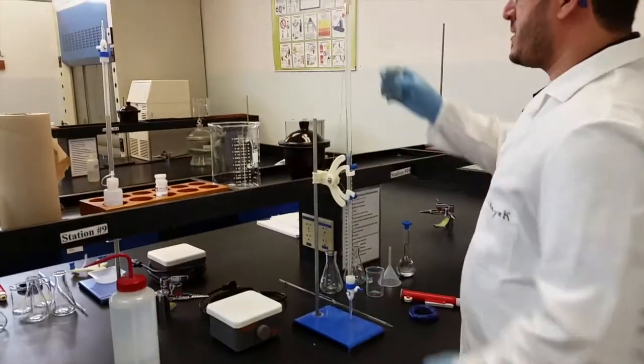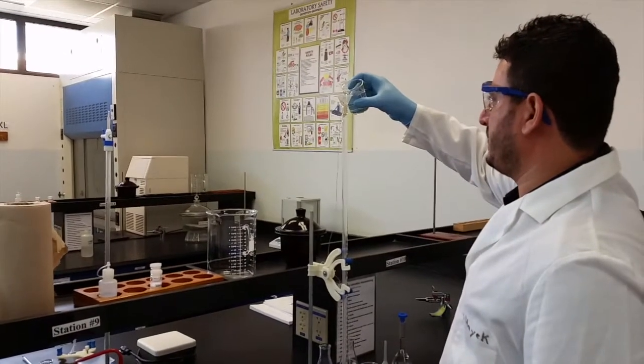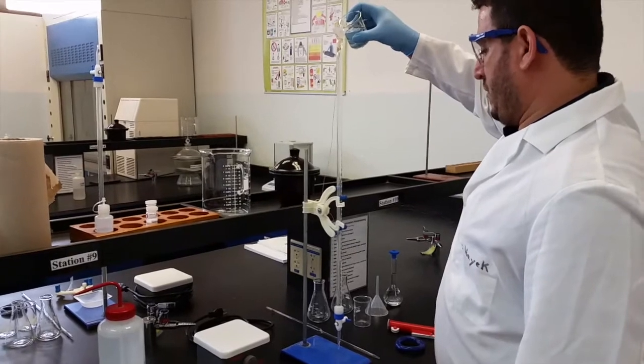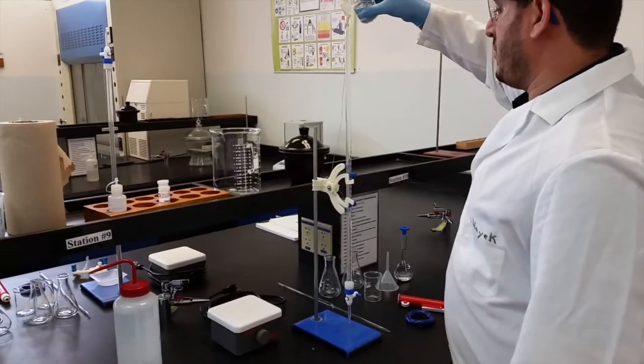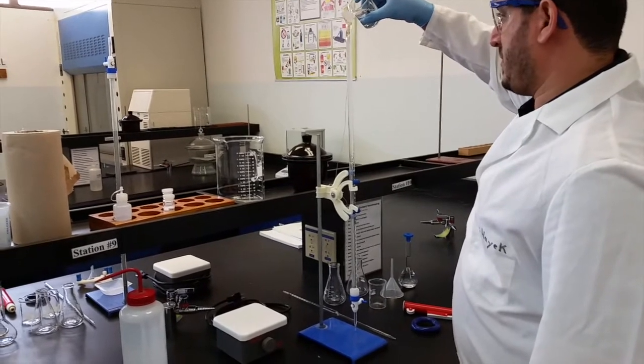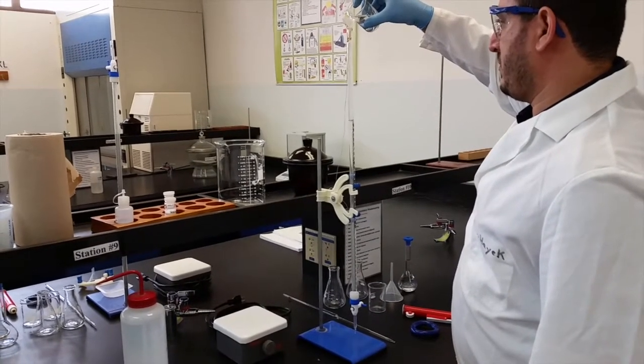Make sure it's closed. You will add slowly. Make sure that you don't have air bubbles inside your burette.